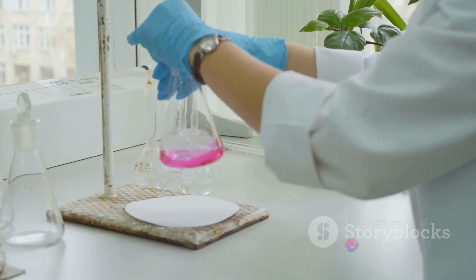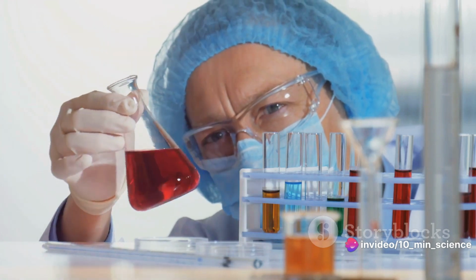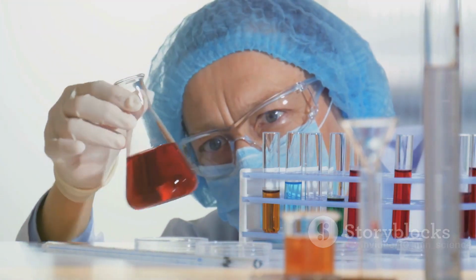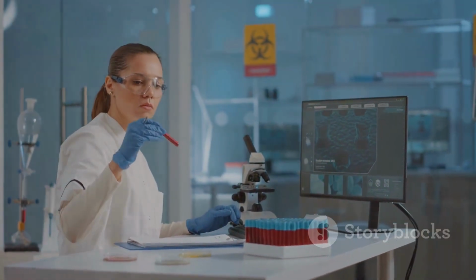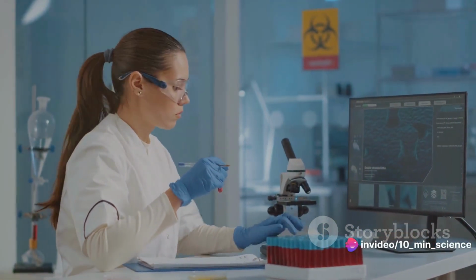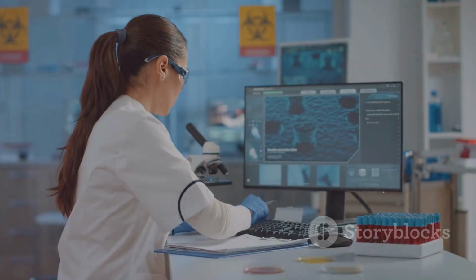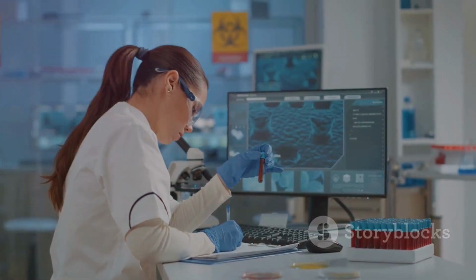But here's the magic of the internal standard. It's subjected to the same conditions as your analyte. So any changes that affect your sample will also affect the internal standard in the same way. Now, when the analysis takes place, the system measures the ratio of the analyte to the internal standard. If there were any changes during the process, both the analyte and internal standard would be affected equally, maintaining the ratio. This is the crux of the internal standard method.